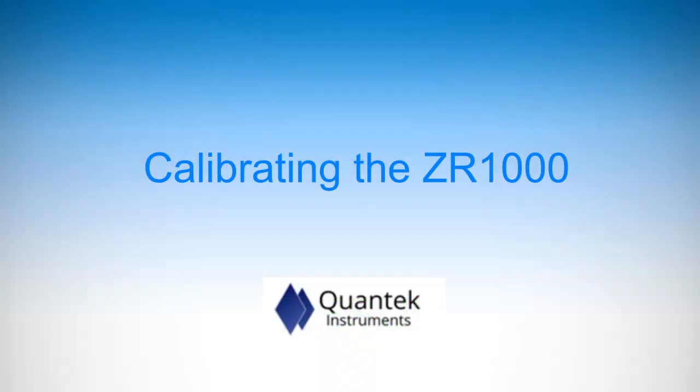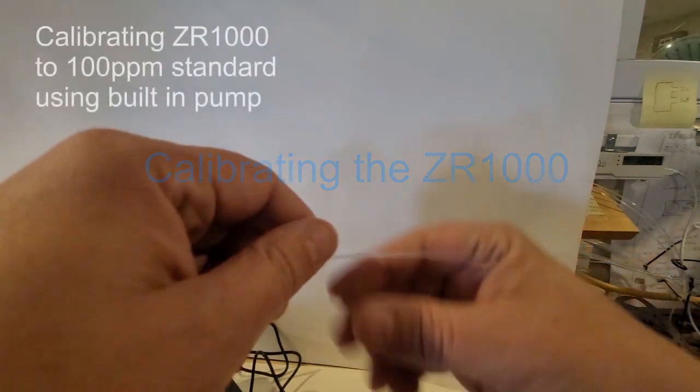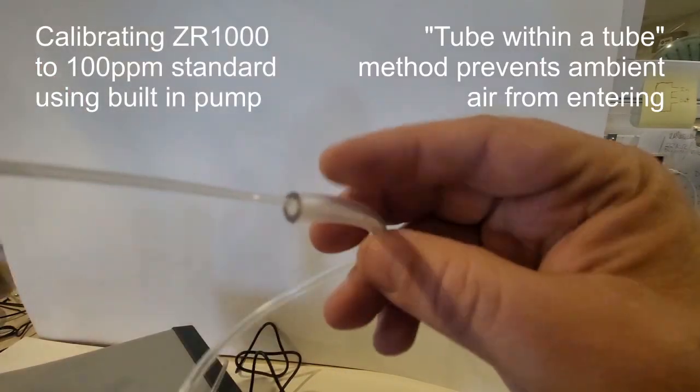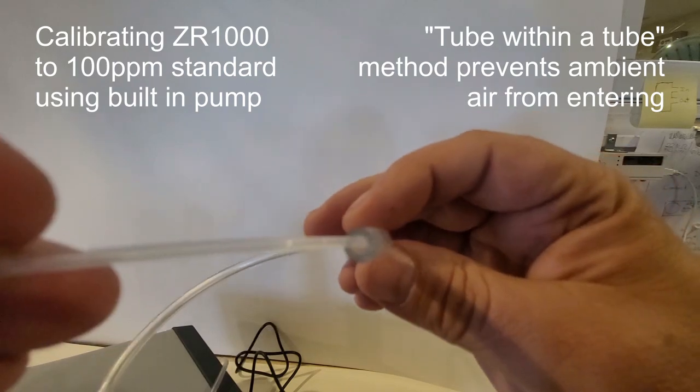Next, let's demonstrate calibration. We'll be calibrating the instrument today to a 100 ppm oxygen standard. For this calibration, we'll be using the pump.